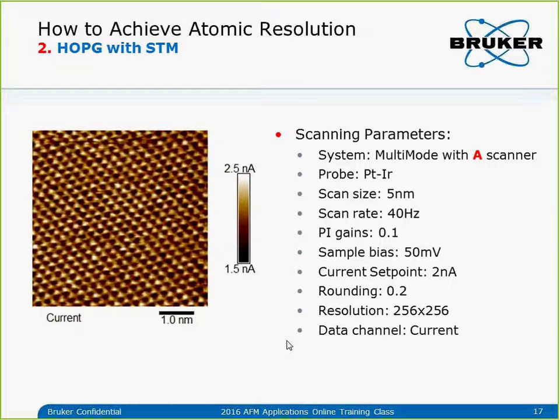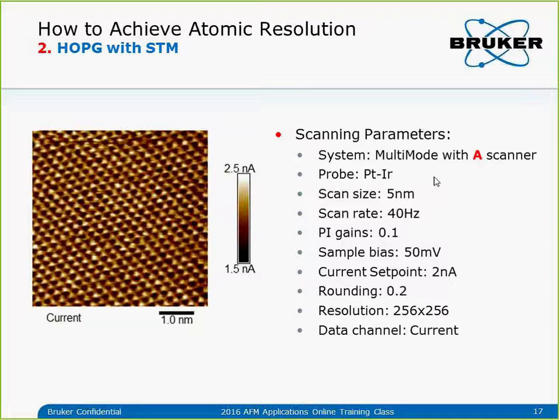Next example is HOPG with STM — I'll briefly cover this. I imaged it with multimode using the A-scanner, which has a much smaller scan range and is designed for this kind of atomic imaging. You can see a very well-defined lattice image with STM. The probe I used is just a platinum-iridium wire cut with scissors. Scan size is about 5 nanometers. Similar to contact mode, I use a very high scan rate — like 40 Hz — and look at the current instead of height. I use very low feedback gain to just track surface slope and drift.